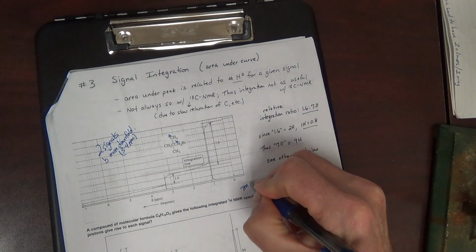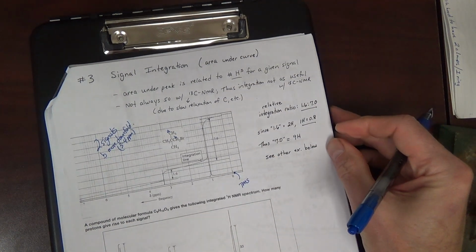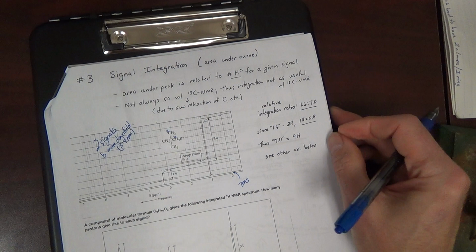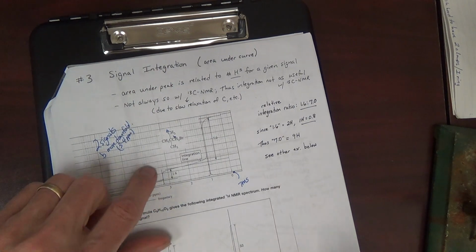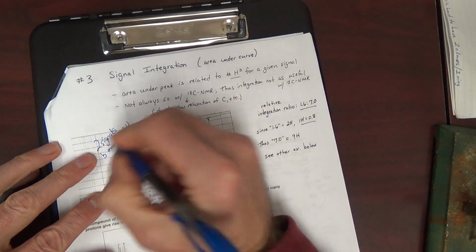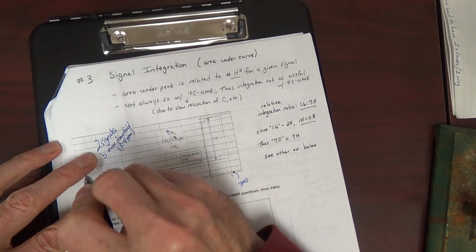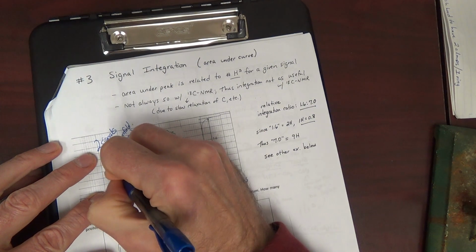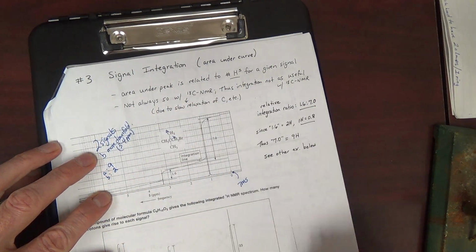TMS, right? Remember TMS? A little bit of TMS. It's not quite on 0 there, a wee bit off, but essentially it's on 0. But let's look at the integration. How many AHs are there? There's 9. How many BHs? There's 2.